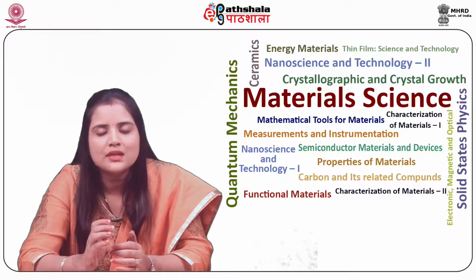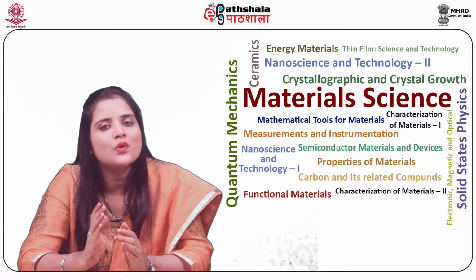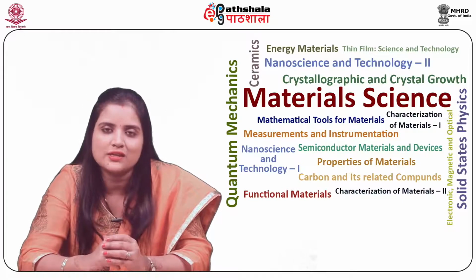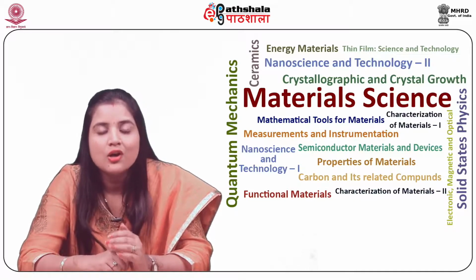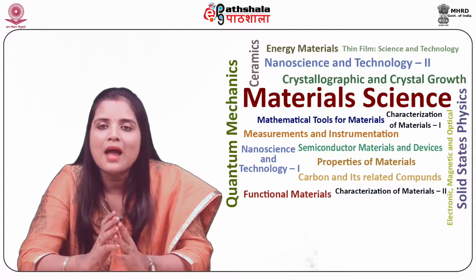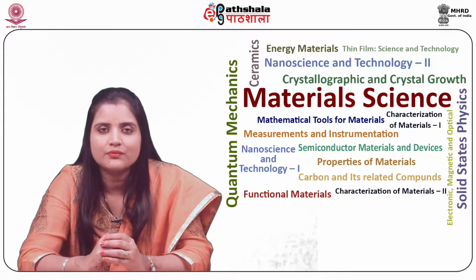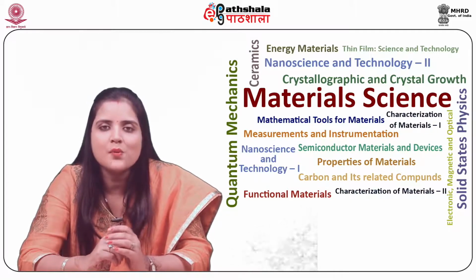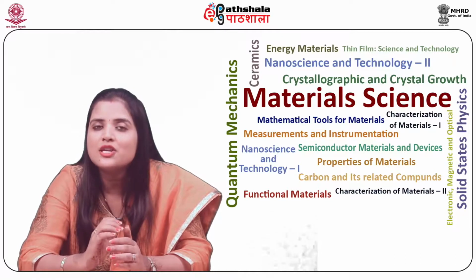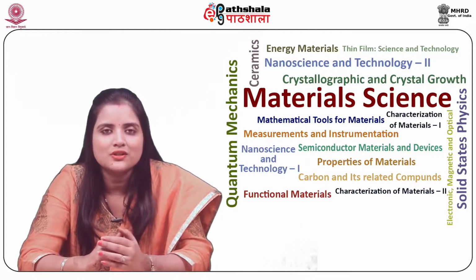The X-ray peaks are typically 2 to 10 electron volt wide, that is, it is the FWHM of the X-ray peaks. However, due to noise, this width can increase by at least an order of magnitude. The vacuum level should be maintained such that the condensation of molecules on the crystal can be avoided.